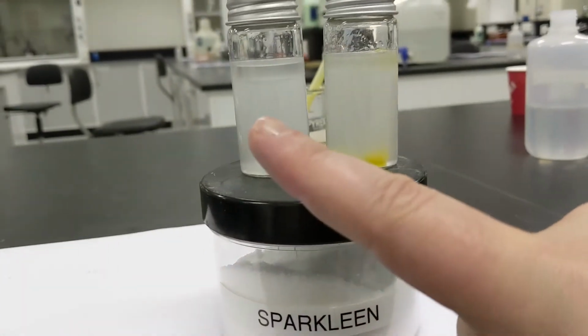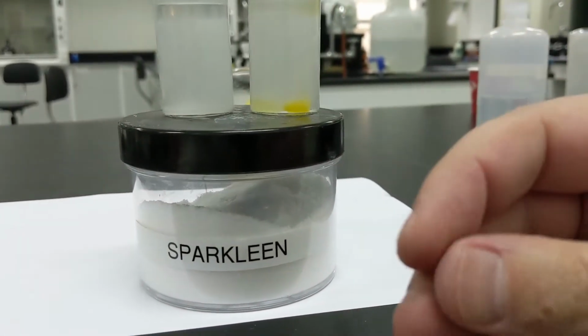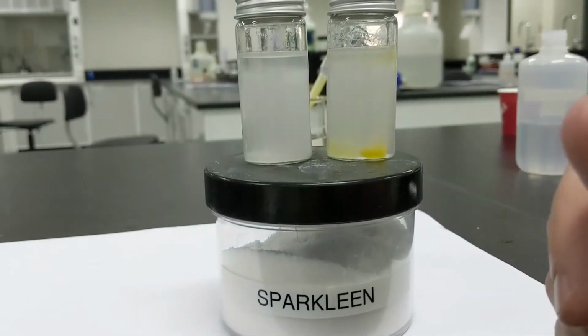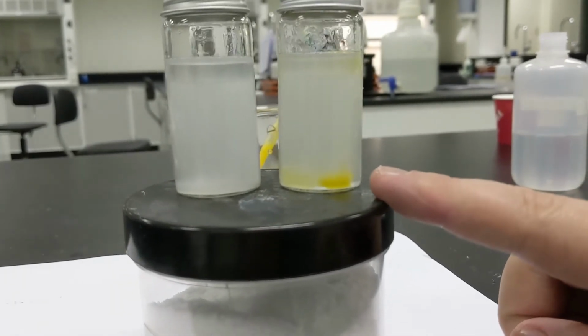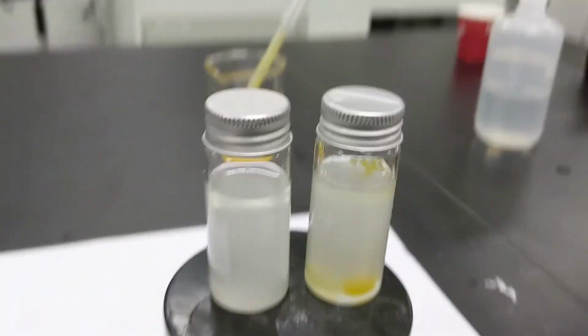Soap has been added to this one. So this is hand soap or glass soap. You can see some on my fingers there. It's just soap. So it's a little white powder, and you can see the egg yolk added to this one. So a little soap, a little egg yolk. Now I'm going to give them a good shake. So let's start with the soap.